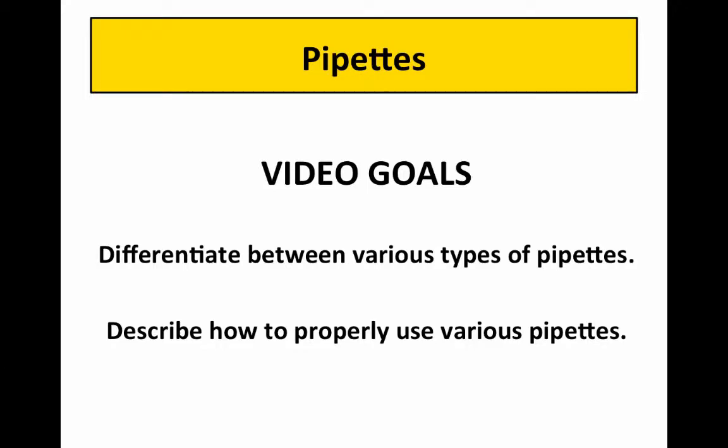The goal of this video is to help familiarize yourself with the different types of pipettes used in a medical laboratory. The video is going to help you differentiate between the various types of pipettes that are used and help you to describe how to properly use them. Lab will give you the experience you need to know how to apply all of this and actually use them during different tests.